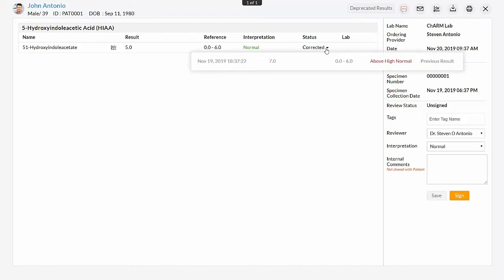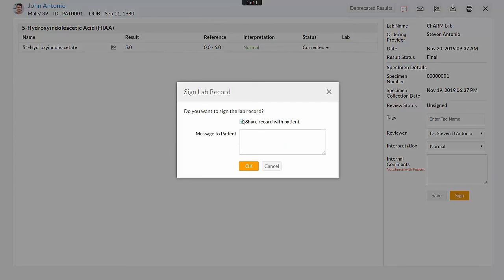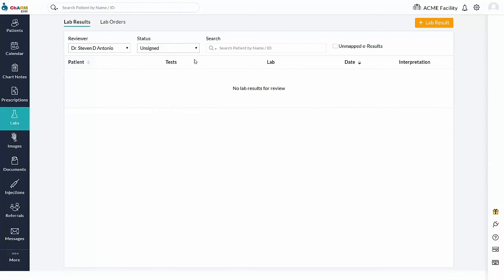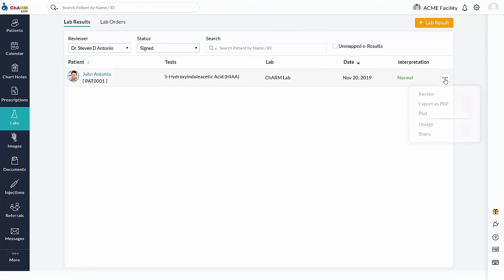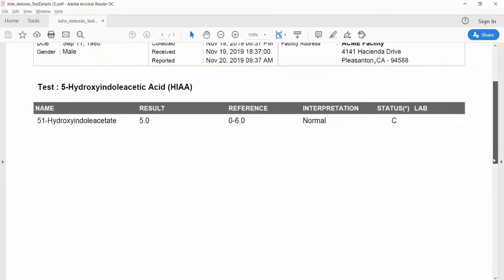On signing, if the patient is already registered with Charm PHR account, share record with patient option can be used to share the result copy to patient through PHR application. You can also send an internal message to the patient if required. Signed results are moved to signed filter view. Result report can be downloaded using export as PDF option.